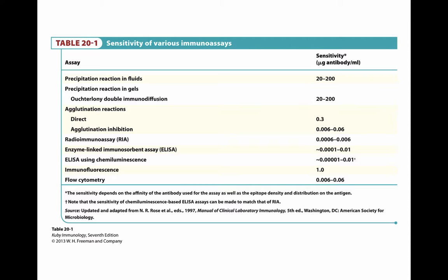Enzyme-linked immunosorbent assays are really sensitive and they're great tools. They've been using them for years. You can measure either the amount of antigen or the amount of antibody in a sample. And the good thing about the ELISAs is it's enzyme linked, so the enzyme linkage gives you a colorimetric change. So you can measure colorimetric changes and be able to tell whether or not you're getting a cross-reaction occurring.